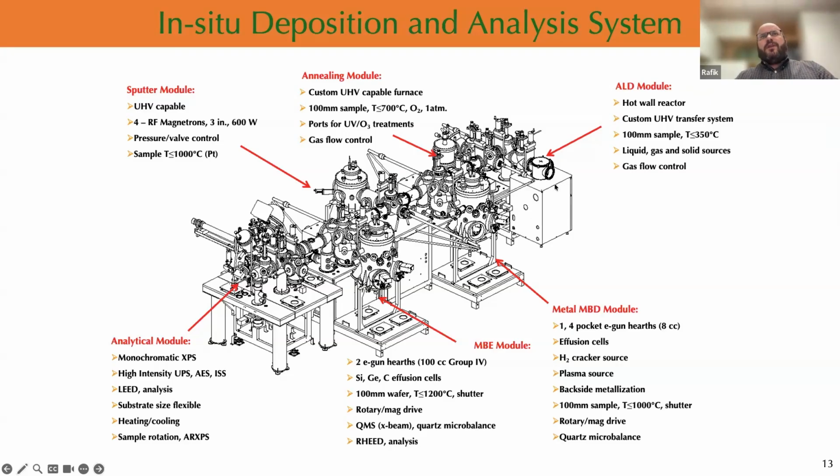In terms of deposition, we can do atomic layer deposition. For now, we have hafnium oxide, aluminum oxide, zirconium oxide, and titanium oxide. We have the precursors to deposit these materials. Here we have a PVD chamber, where we deposit metals by evaporation, and we have up to 8 metals in the same chamber.